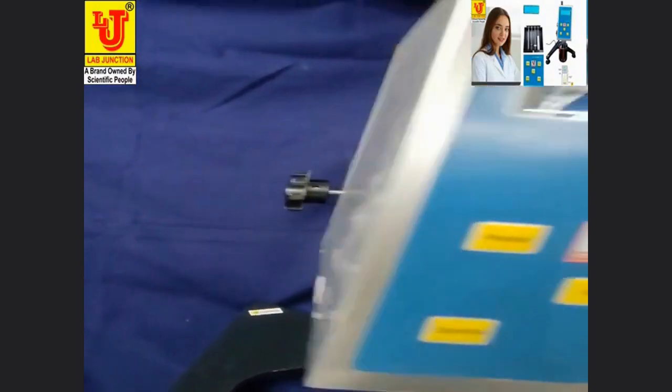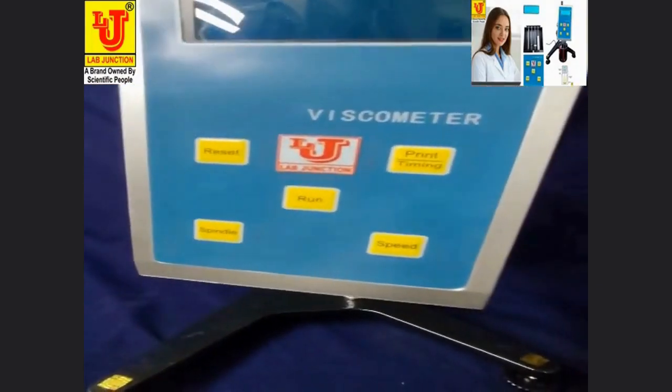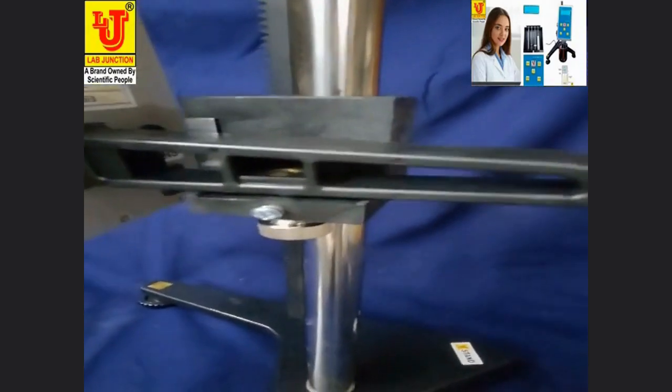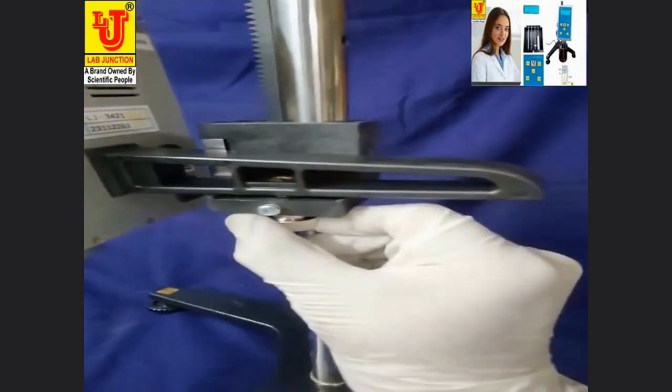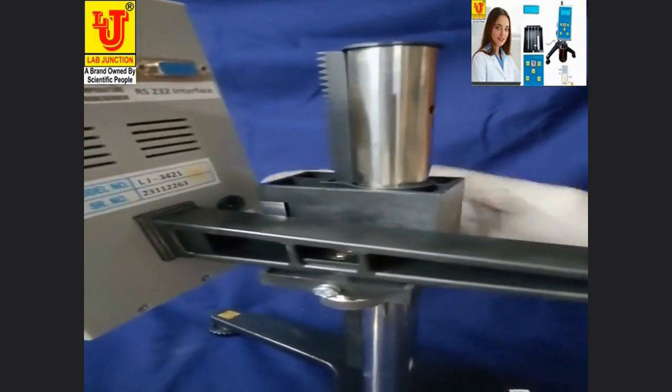Now fix the display like this, on this jack, and tighten it. Now this is movable.